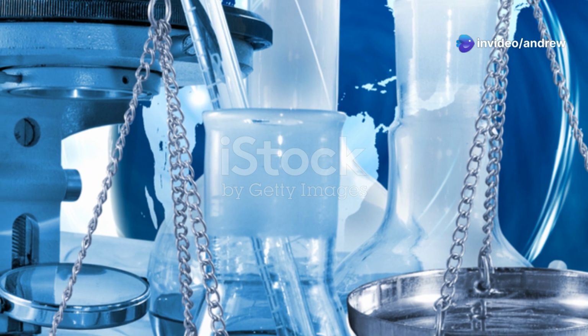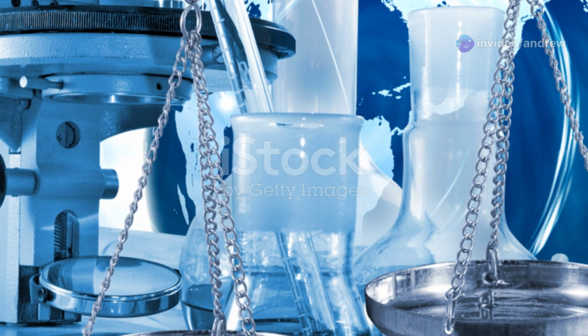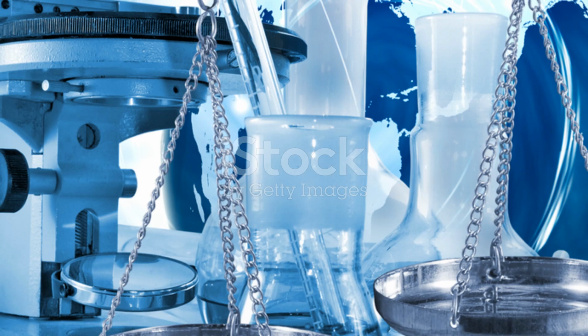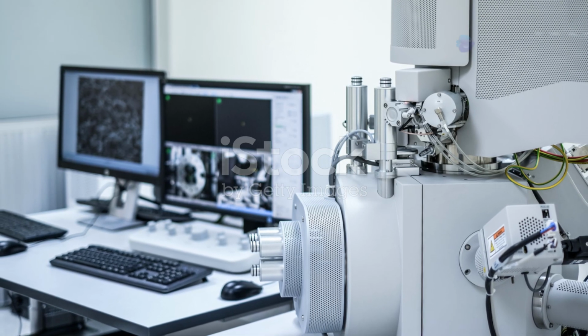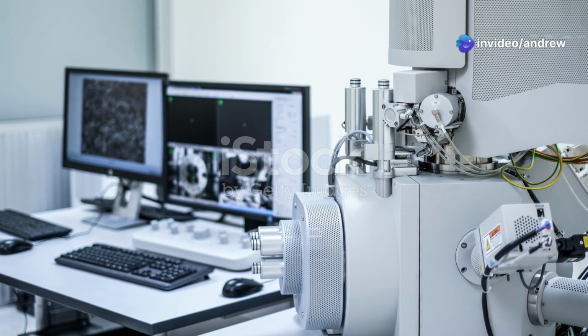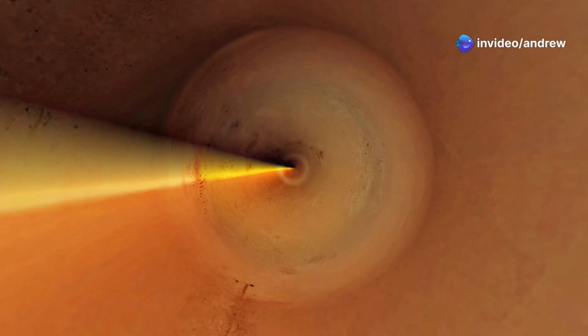The reflection electron microscope, or REM, is a type of electron microscope that uses an electron beam to probe the structure of surfaces. Like TEM and SEM, REM relies on the interaction of electrons with matter but captures the reflected electrons. In REM, the electron beam is incident on the surface at a grazing angle, and the reflected electrons are used to form an image.